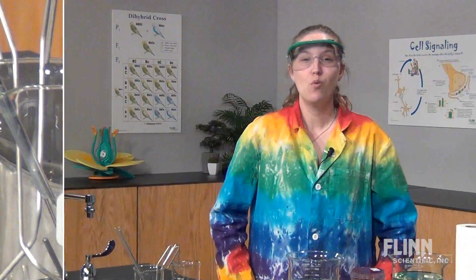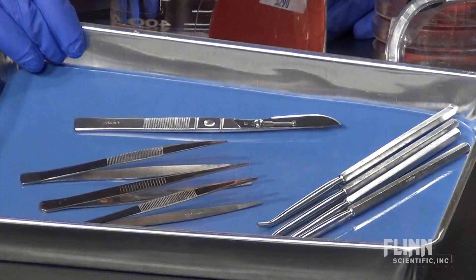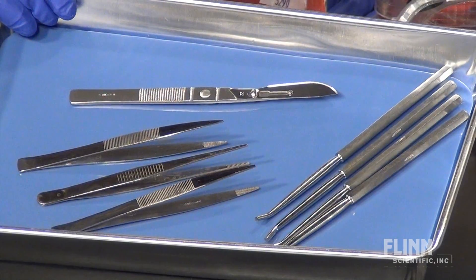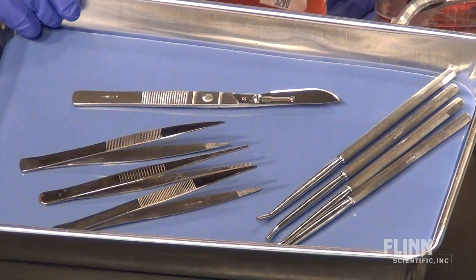Wipe down all lab bench surfaces with an antimicrobial or bleach solution. Dissection materials should be thoroughly cleaned with soap and water and dried completely before being stored — any remaining moisture will likely cause rust in the hot and humid summer months.